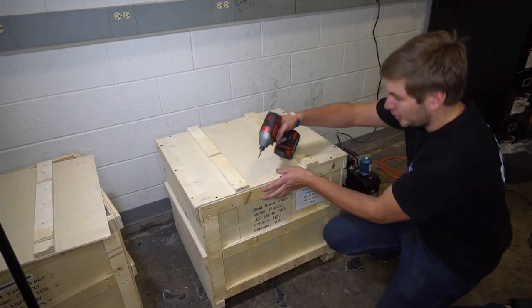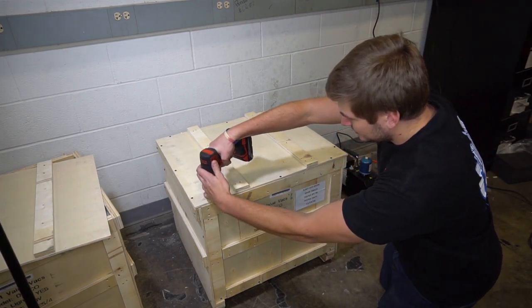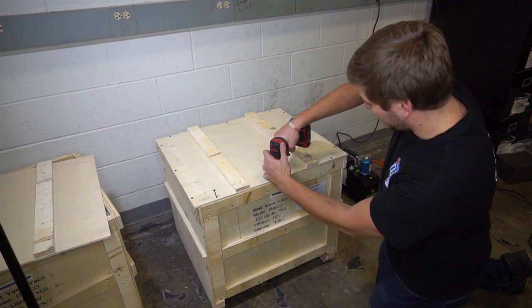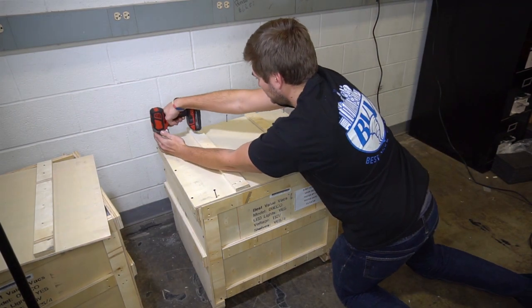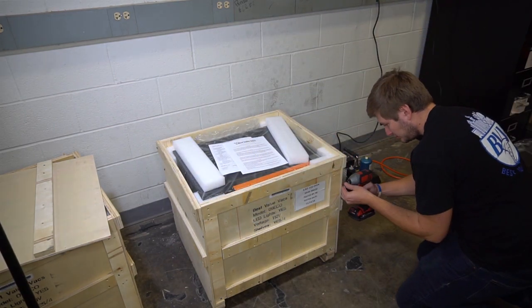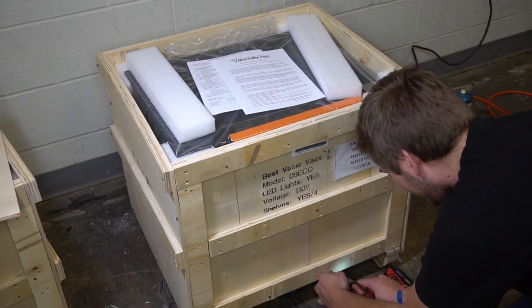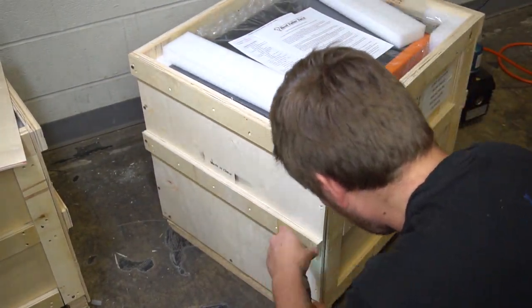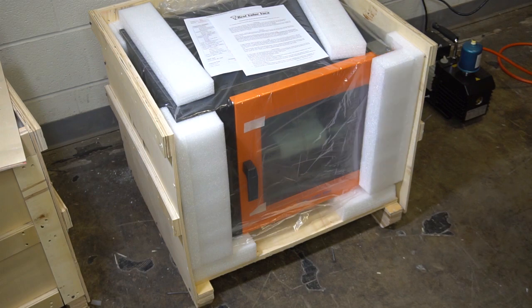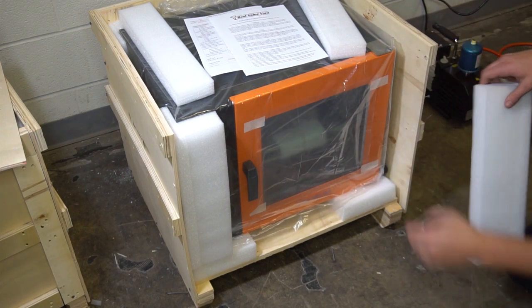We'll start off here by just opening this crate. A standard number two Phillips bit will do. Now that our oven's opened up, we'll go ahead and remove some of this packing material.